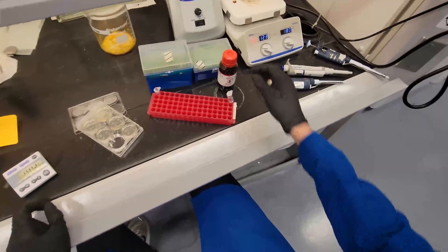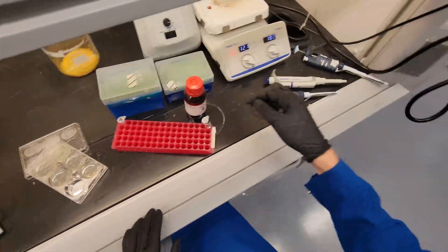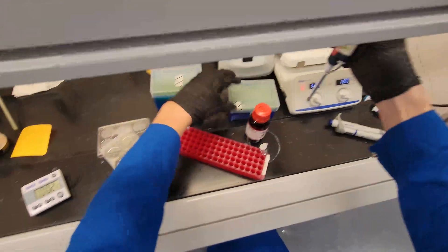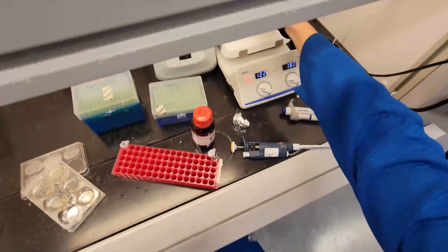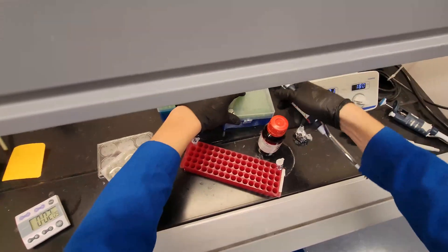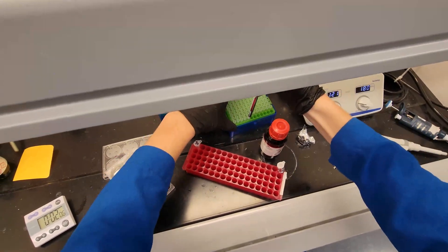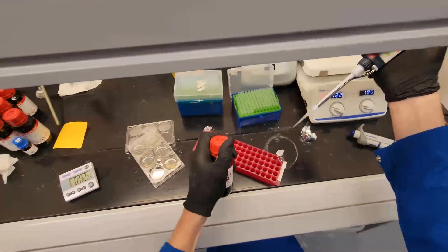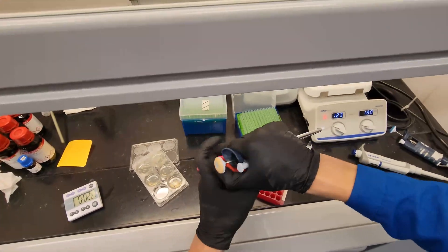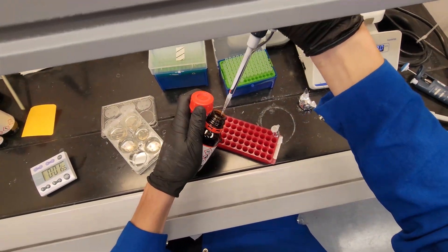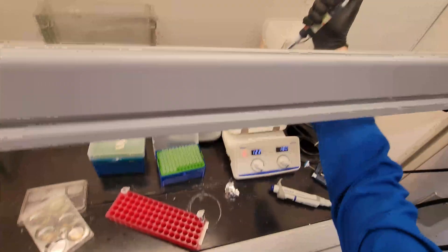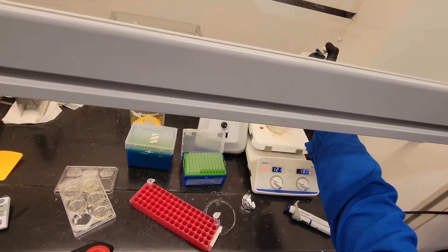Or right before the 10 minutes is up, I'll add the BME and the DTT solution. And then we'll pipette it carefully onto the cells. Okay. So, the timer is getting close to the end. I'm going to add the mercaptoethanol and the DTT. 67.5 of the mercaptoethanol. Take this lid off. I'll take the lid off, but I'll keep it mixing. I'm not sure if you'll be able to see the flask that's mixing, probably out of frame. But it is mixing and I'm just going to add the DTT. Sorry, the BME. Somebody's strong. Alright, 67.5 of that. I'm going to add it into the liquid and pipette up and down just to rinse the pipette tip.